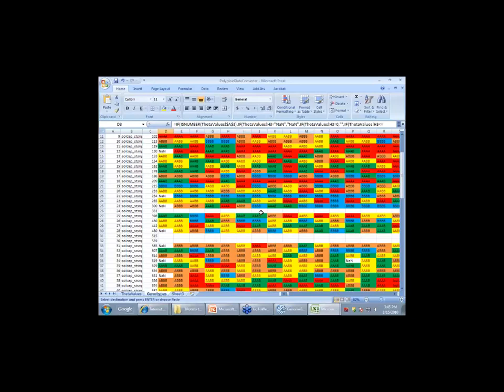So the question is, can you make this haplotypes instead of just genotypes? That's the next step, because we don't know how close these SNPs are. For some of these SNPs, we already know the haplotype within genes, and they'll be connecting the data that Robin is putting together, because she knows where these are within the sequence. And some of them really are haplotypes because there's more than one SNP per contig, and so that'll give you the haplotype. But right now we're not there.